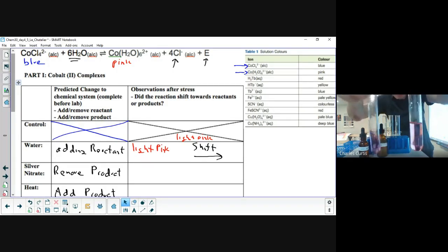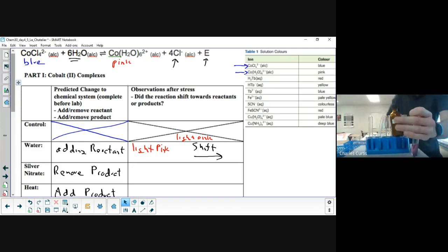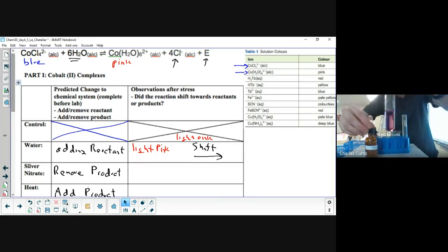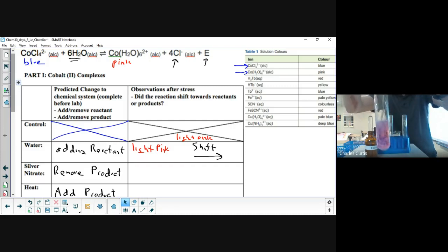And again, in my right hand, this is the control. This one was the one we added water to. So next, silver nitrate. So I'm expecting a precipitation reaction, but that's not the color change I'm after. I'm looking at: does it stay pink or does it go blue? And there's that precipitation I was expecting. Silver chloride solid is white. So I'll give this a good shake.